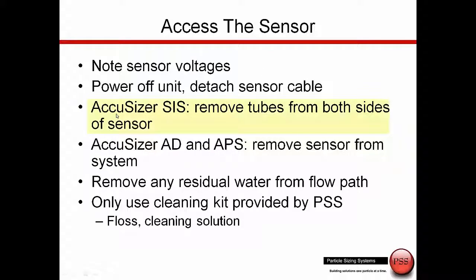With the AccuSizer SIS system, we can simply remove the tubes from both sides of the sensor to have access. When using the AccuSizer AD or APS, we'll need to remove the sensor completely from the system.